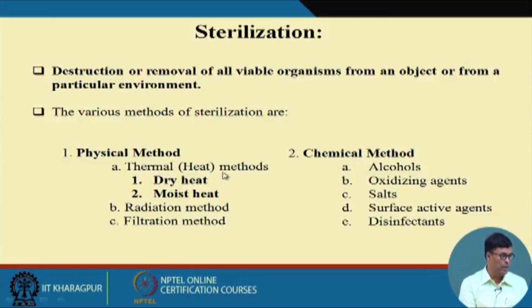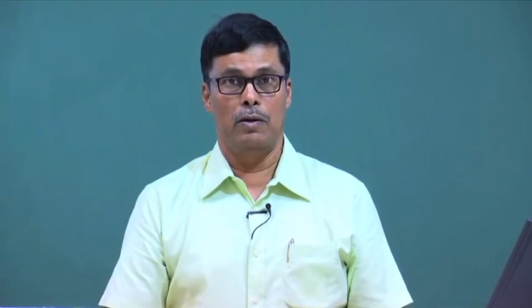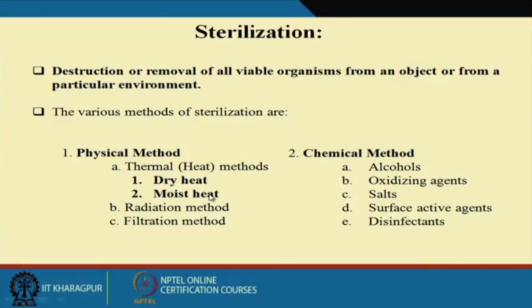One is heat, which is the best for media sterilization, because media is liquid and heat is transferred by three different mechanisms: conduction, convection and radiation. All three processes will be very active in medium sterilization. We have two methods: dry heat and moist heat. We have seen moist heat is much more effective as compared to dry heat. I shall show you later. Then the radiation method, then the filtration method.